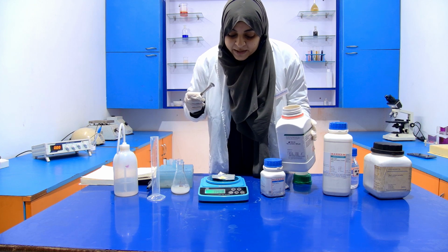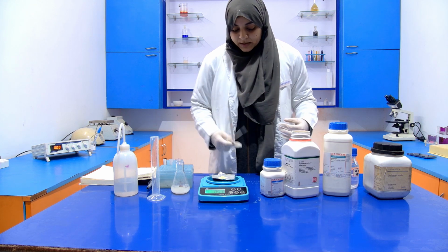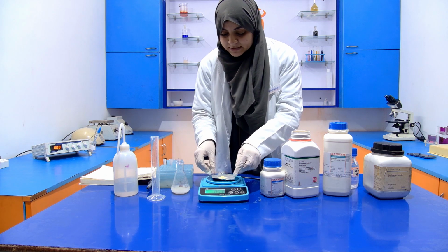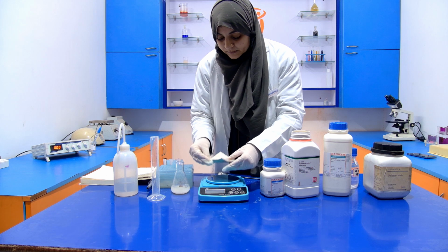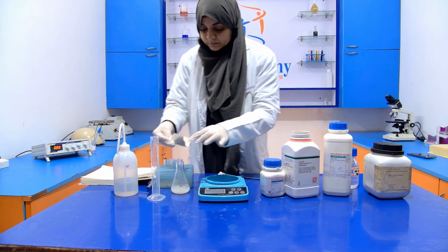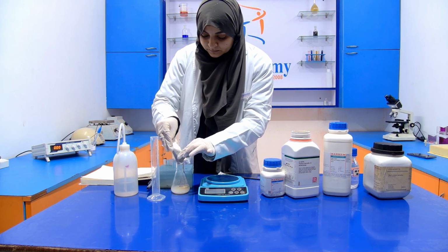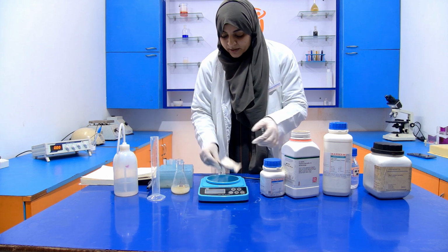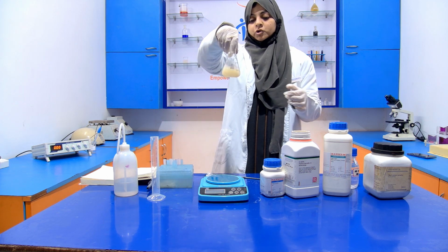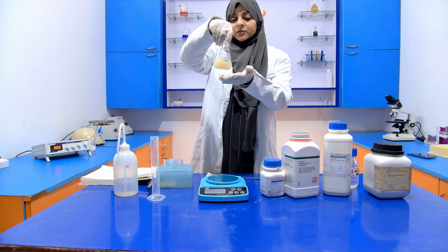Now it is 0.51. Now I am going to add this into the distilled water. Now again we have to dissolve it into the distilled water.